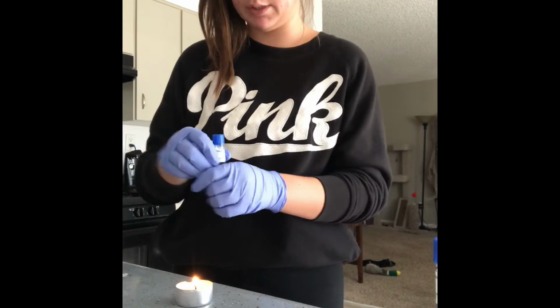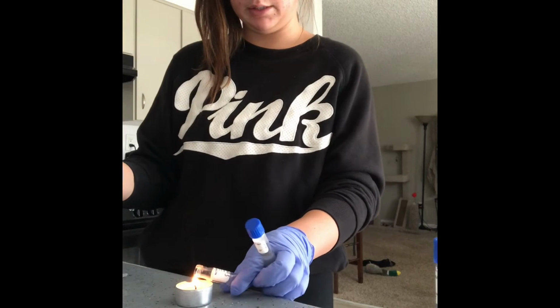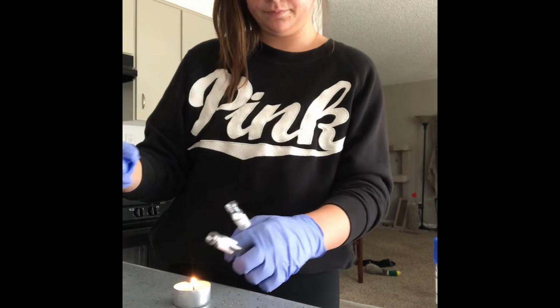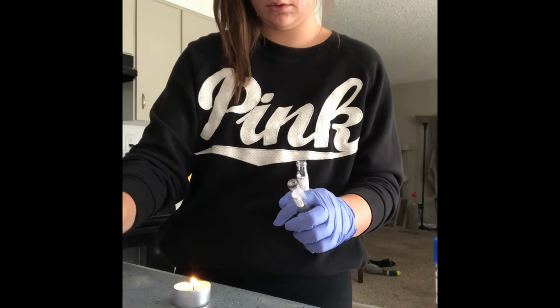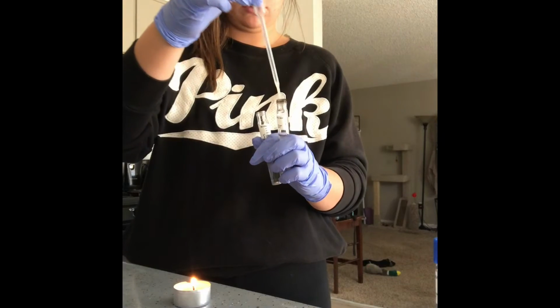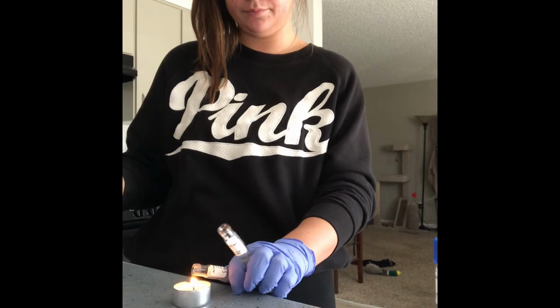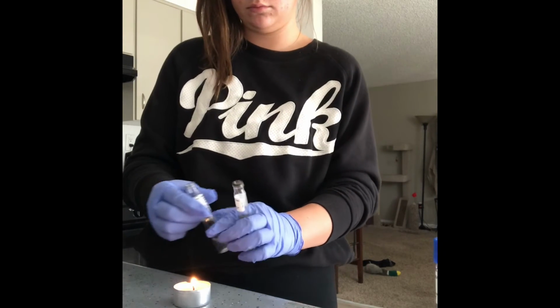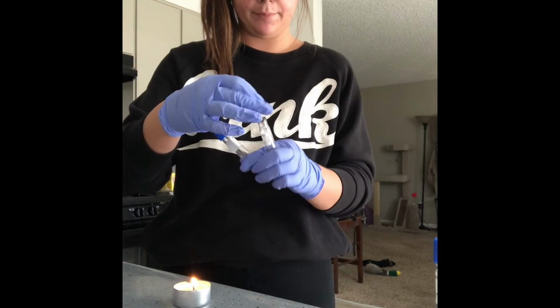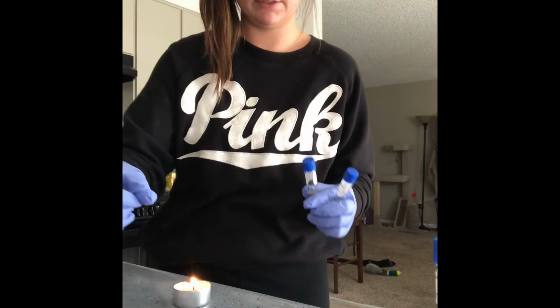Now I have my 15%. So I'm going to go ahead and sterilize both of these. Two drops into my 15%. Sterilize again. And replace the caps. So now I'm going to incubate these ones for 24 hours, and then I'll observe, and if they're not finished, I'll do for additional 24 hours.